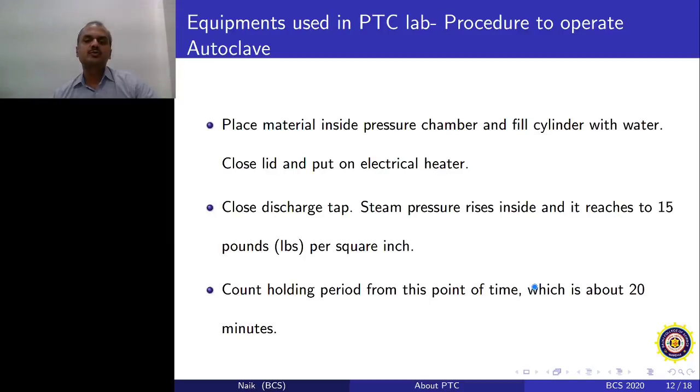Generally it's better to wait for 1 or 2 days after you autoclave the media, and just keep it at normal temperature on your lab benches. It will solidify after a few hours, and after solidification, if within 24 hours you see any kind of bacterial or fungal colonies, that clearly means the autoclaving time is not enough. There could be many reasons why it would happen, but if you find repeatedly that you are getting contamination the minute you autoclave your media, I think it is better to check the autoclave.